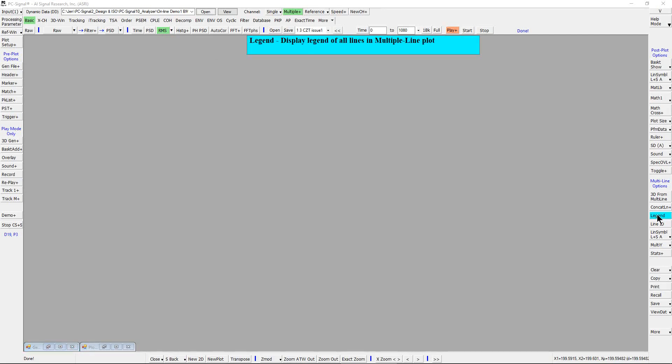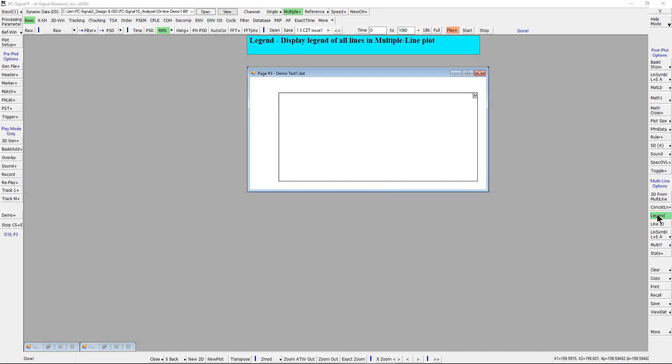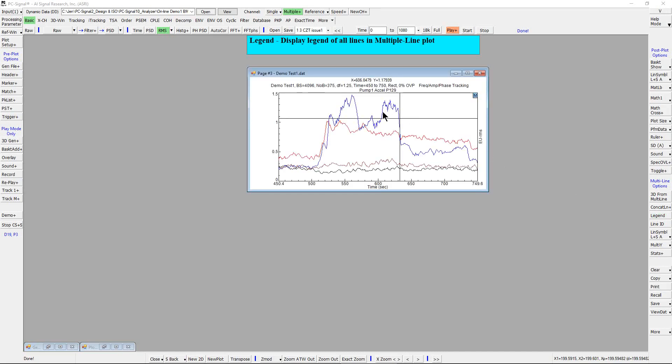Legend is used to display the legend of all lines in a multiple line plot. This figure shows a typical multiple line plot with four lines overlaid.